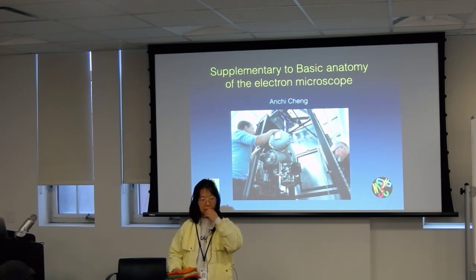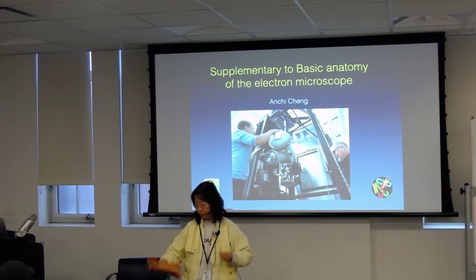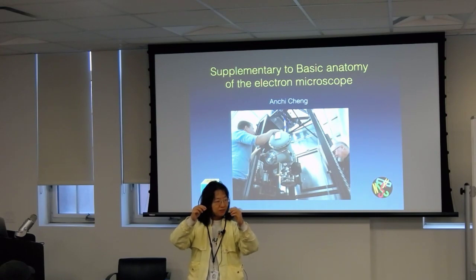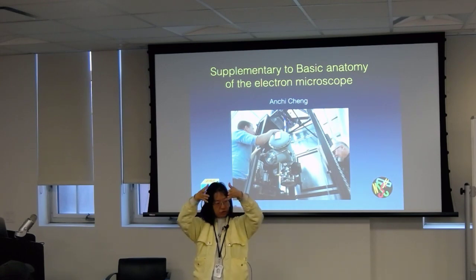Okay, so with a glass lens, your lens can be made so much better on the lens part. You can still make all those different parts with deflector and all those things. But of course, with the glass lens, oftentimes you just adjust the lens itself, because to deflect the light, you need a mirror and things like that to do your deflecting part, right? To get your source straight.